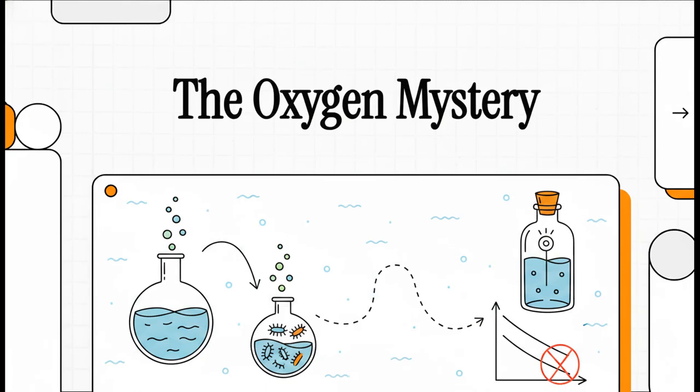Okay, let's dive right into this explainer and solve what is honestly a pretty fascinating laboratory mystery. We're going to look at why water quality scientists will completely discard certain biological oxygen demand tests, BOD tests, when the oxygen in the sample runs out. I mean, it sounds totally counterintuitive, right? If you're measuring how much oxygen gets used, and literally all of it gets used, shouldn't that just be your answer? Well, the science of water testing is kind of more complex than that.